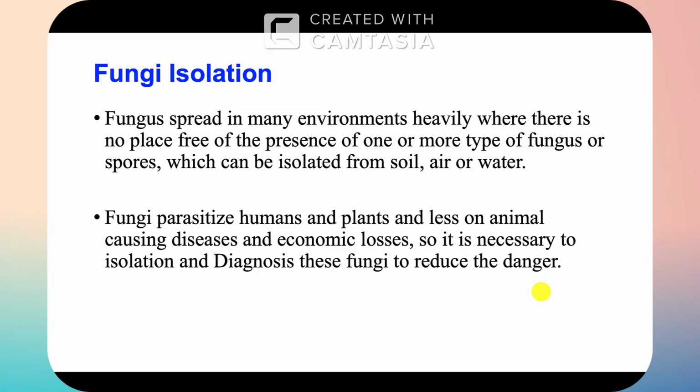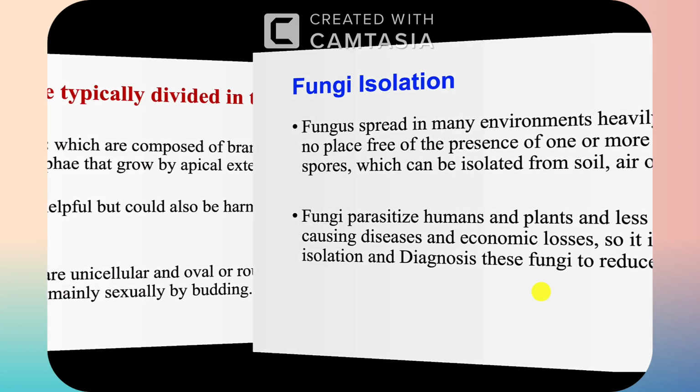So how can we isolate? This is our practical topic. How can we isolate the fungi from the soil, and then how can we detect this and do the identification of those fungi which we isolated?